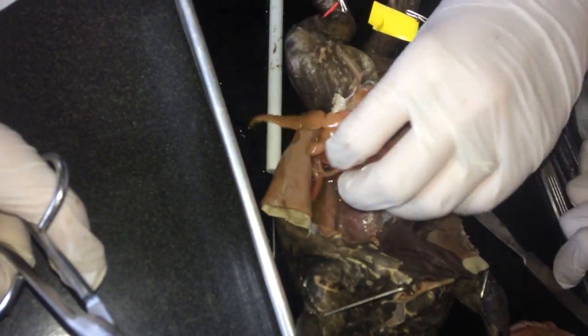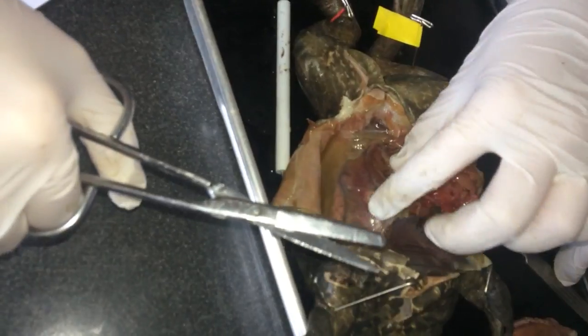This is a fat frog. Can we take these out? Mm-hmm. Nope, nope. I just tore a bunch of them.